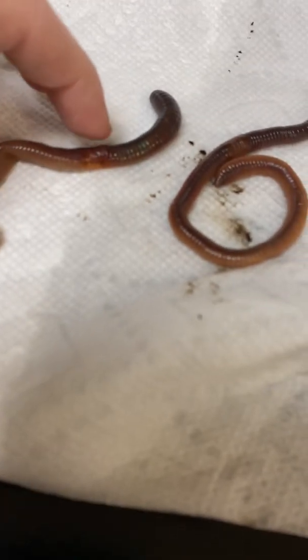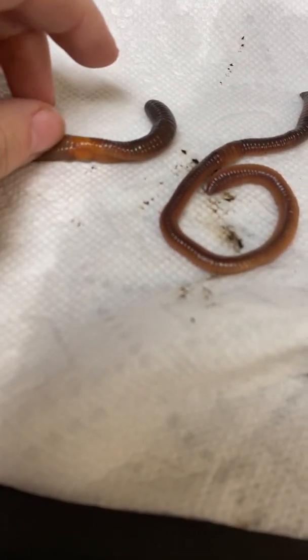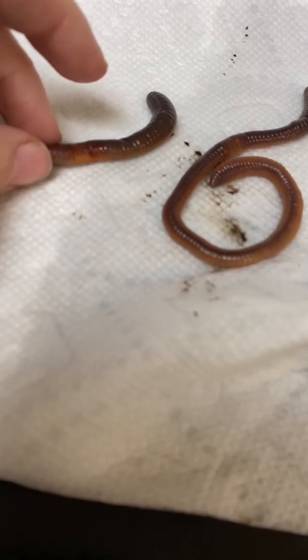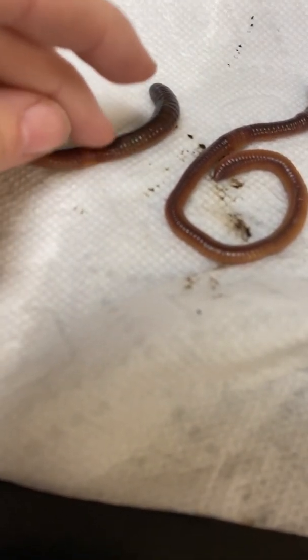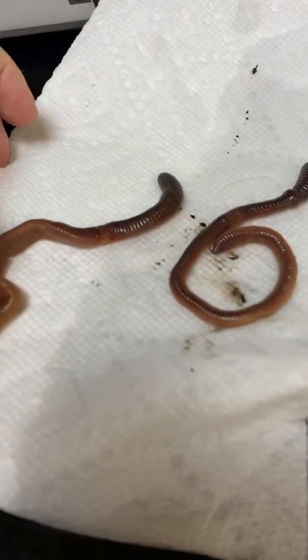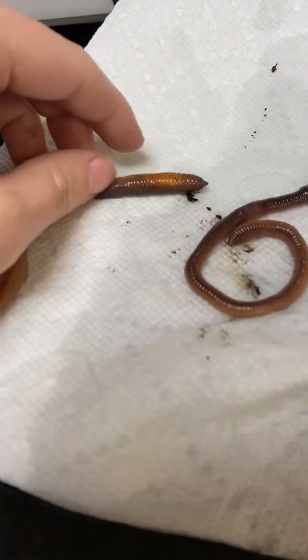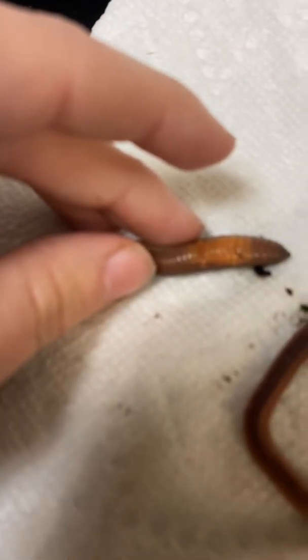The structure right here where they attach to the other earthworm during reproduction. You can kind of see the underside right there. And it also secretes the cocoon with the eggs. That is called the clitellum. And you can actually see on the underside right there, this little, it's not going to focus, I don't think.